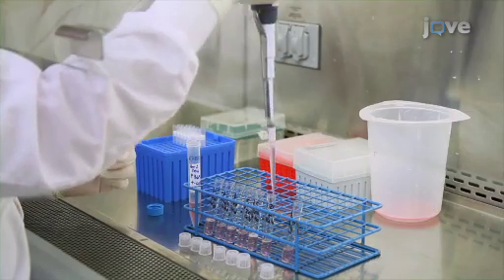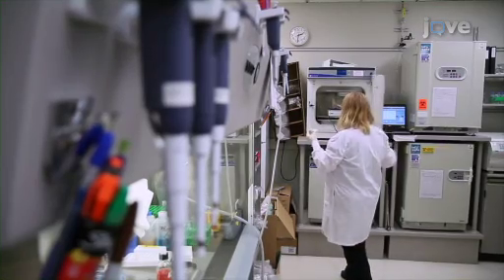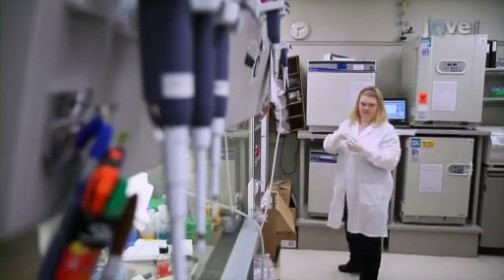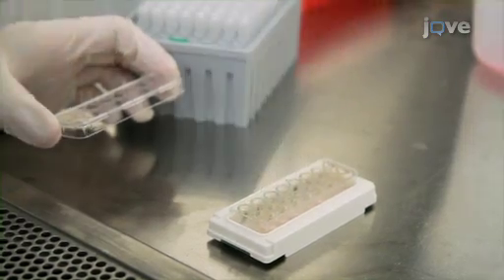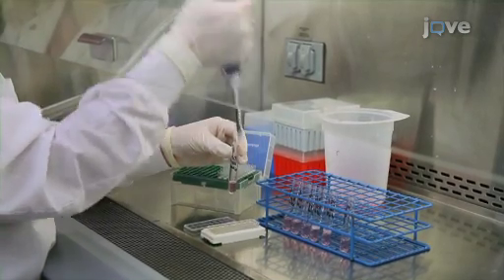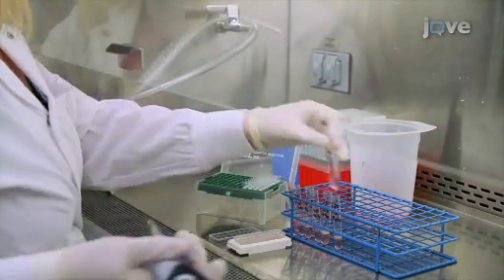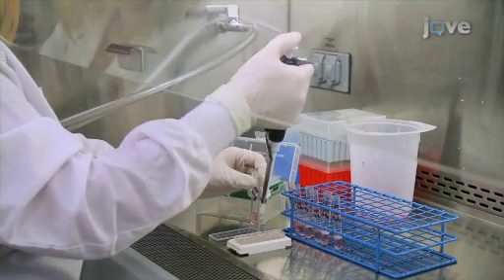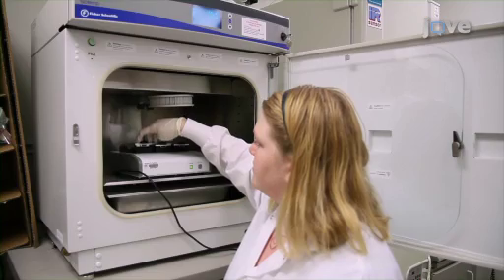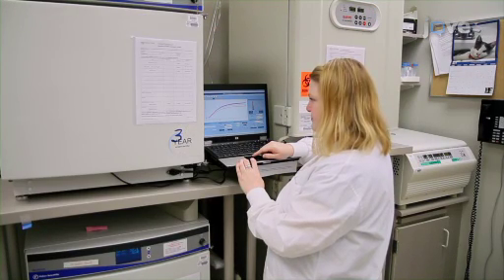The last dilution of the series should provide 1.25 T-cells per tumor cell. Pause the Excelligence station and remove the E-plate. Using a pipette, remove the media in the wells. Then load 200 microliters of T-cells using all the concentrations from the dilution series. As a negative control, use pure media. Return the E-plate to the Excelligence station and continue the program. At the end of the assay, normalize the results.